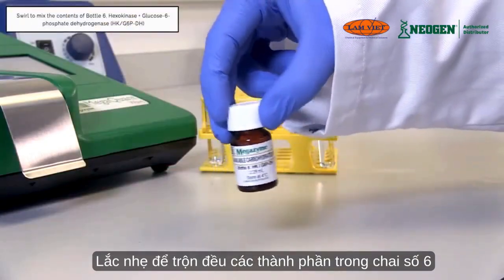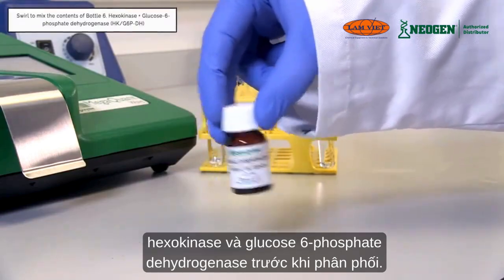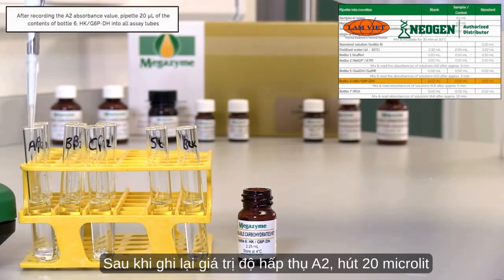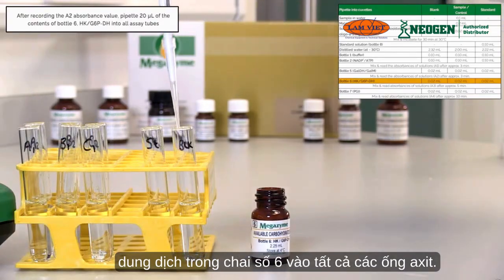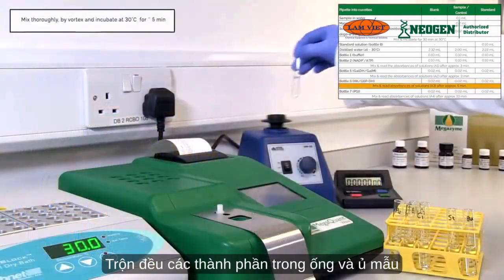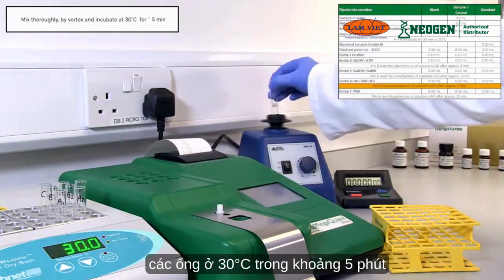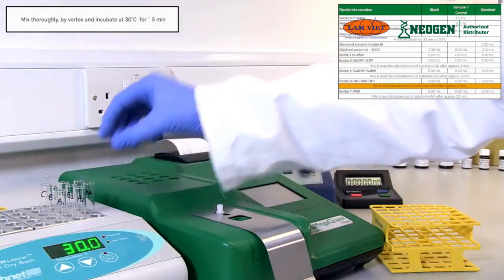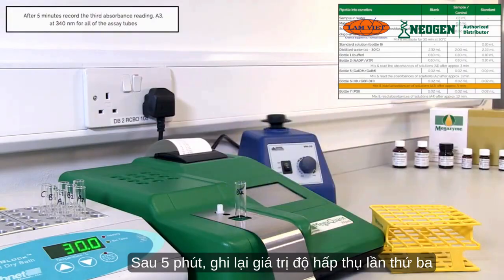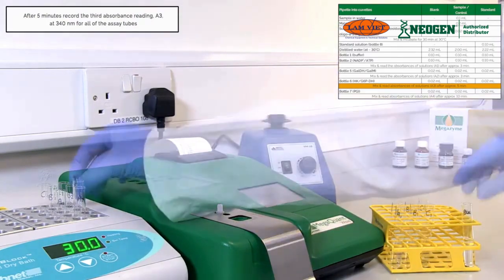Swirl to mix the contents of bottle 6, hexokinase and glucose 6-phosphate dehydrogenase prior to dispensing. After recording the A2 absorbance value, pipette 20 microliters of the contents of bottle 6 into all assay tubes. Mix the tube contents thoroughly and incubate the tubes at 30 degrees Celsius for approximately 5 minutes. After 5 minutes, record the third absorbance reading, A3, at 340 nanometers for all of the assay tubes.